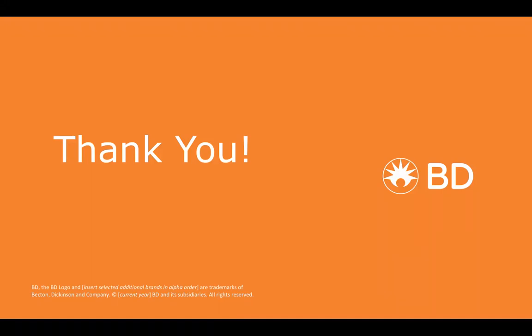Of course, it's always advisable to do some other work to validate those findings and double check that the factors that make those things close together in embedded space are also present in the higher dimensional data. And yes, this whole session is being recorded, and it will be published after we finish with the webinar.